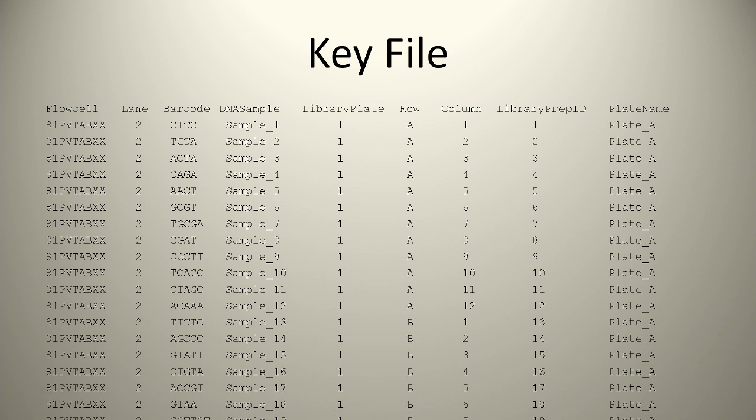And when you're talking about merging, that's a really, really good point. I would merge things that are the same library prep ID. If those are different, something has gone terribly, terribly wrong, at a level where you just want to throw out all your data anyway.